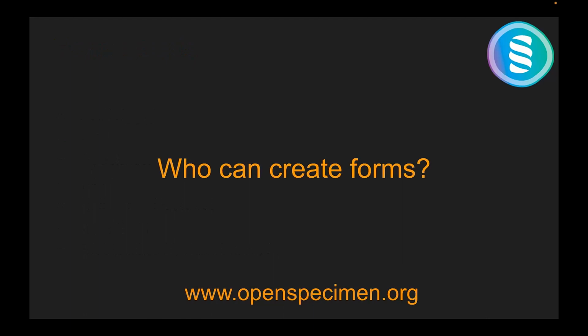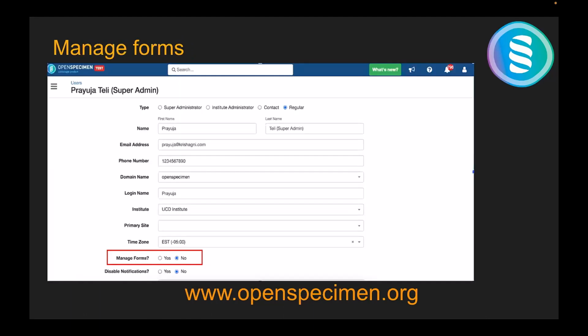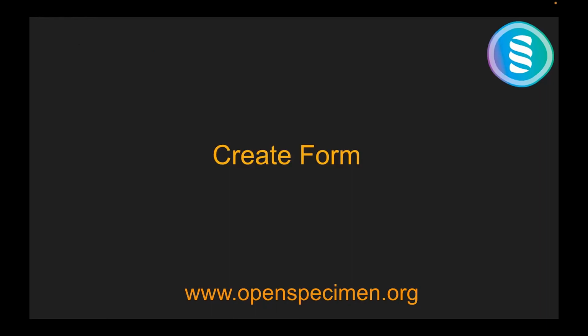Now, who can create forms? Usually the forms are created by the admins, but additionally within your user profiles you will see a manage forms section. If this manage forms is marked as yes, then any regular user can also manage forms. So your site admins, institute admins, super administrators, all of you will be able to create and modify these forms.